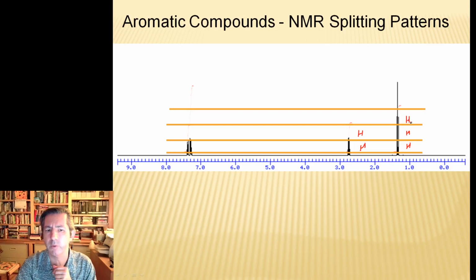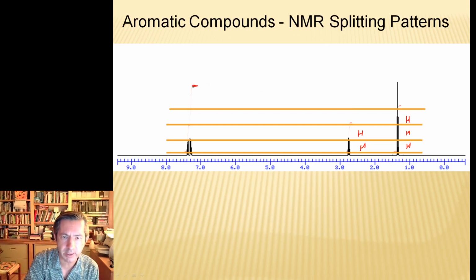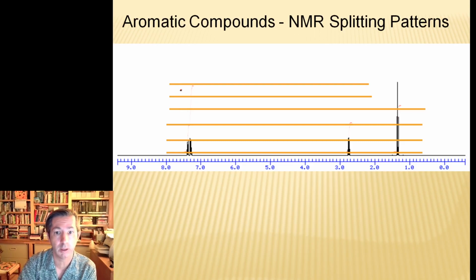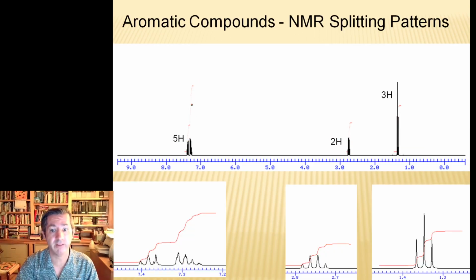Which we've seen before last semester. Now if we jump back over here, let's not forget we got an integration line up top. Let's put in a signal there, and this is a pretty wide gap. We're going to put in another hash mark for our hydrogen ruler. And we've got 1, 2, 3, 4, 5 hydrogens in this signal. Here's our ratio, 5 to 2 to 3.